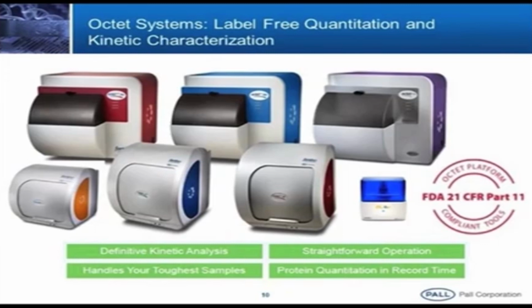Okay, this is an 8 channel instrument, which I brought here. At a time you can run 8 samples. You can finish kinetics or quantitation studies. Say, for quantitation, you are expressing proteins and have a question about the concentration. With this 8 channel instrument we can measure 8 samples at a time. We can perform different dilutions in kinetics, from higher to lower dilutions, and conduct kinetic studies here.